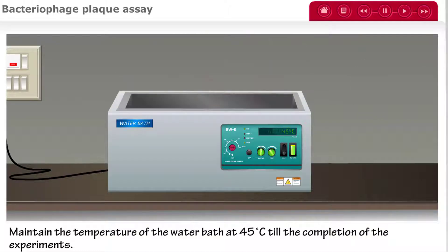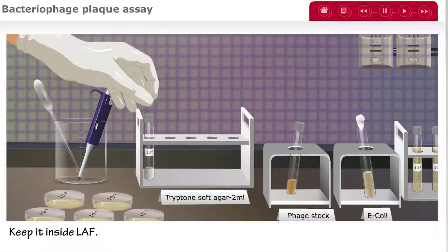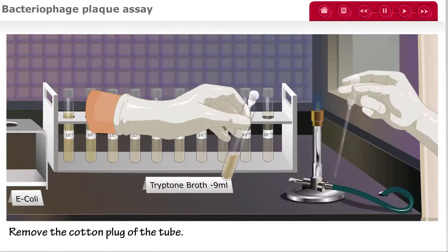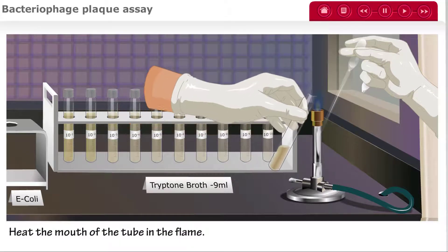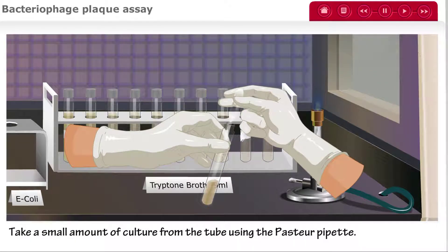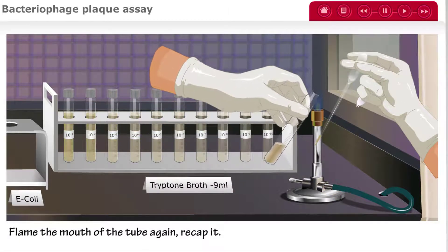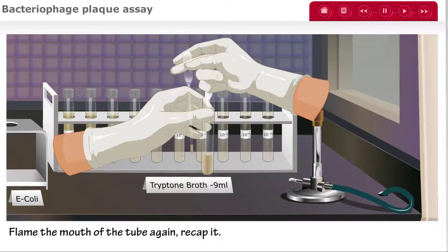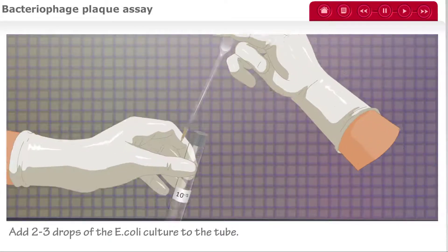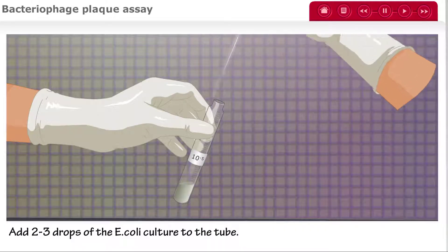When you are ready, remove the lid of the water bath and take out the soft agar tube labeled 10 to the negative 5. Take a sterile Pasteur pipette and grab the E. coli culture tube. Remove the cotton plug from the tube and heat the mouth in the flame of the Bunsen burner. Take a small amount of the culture from the tube using the Pasteur pipette, then flame the mouth again, recap the tube, and place it back on the rack. Add 2 to 3 drops of the E. coli culture to the soft agar tube labeled 10 to the negative 5, then replace the cap.